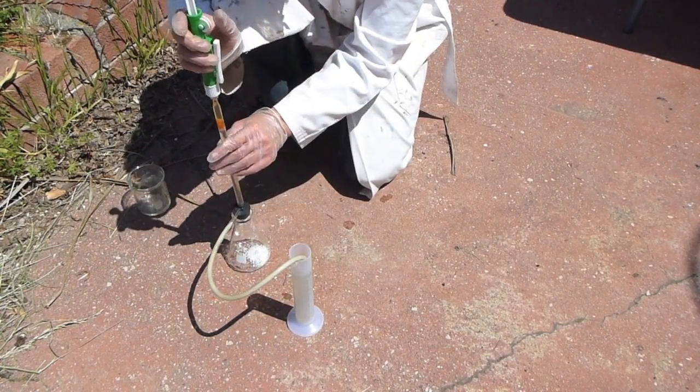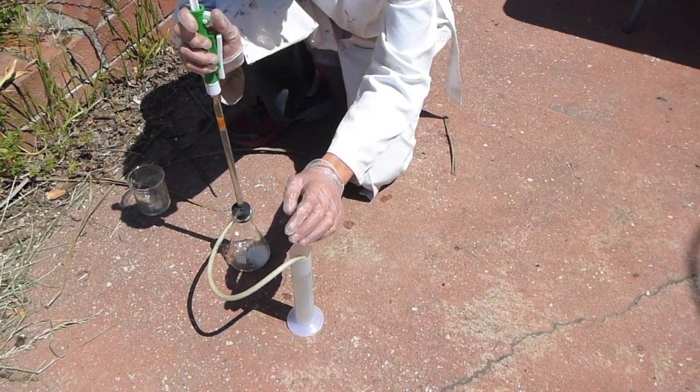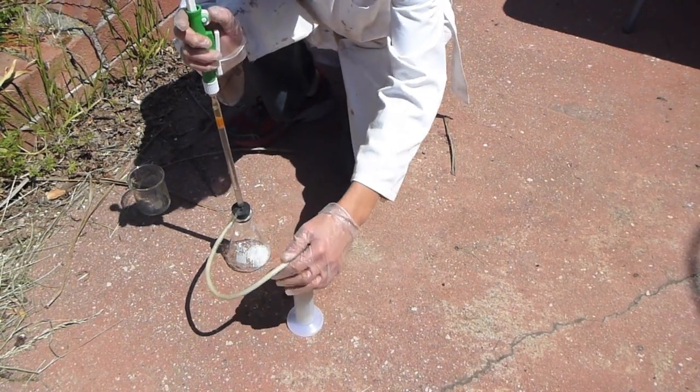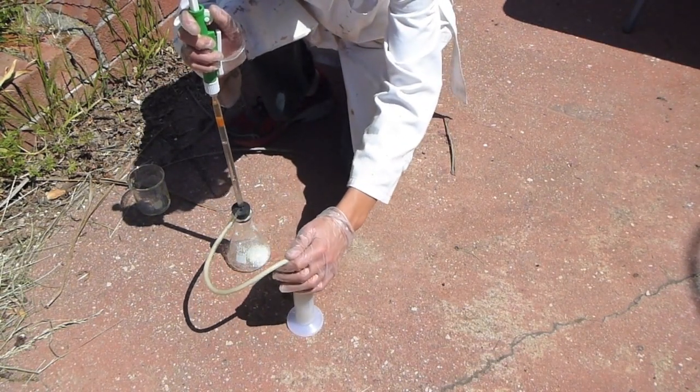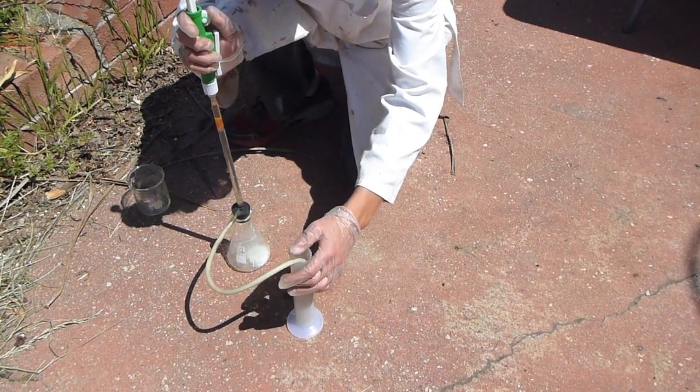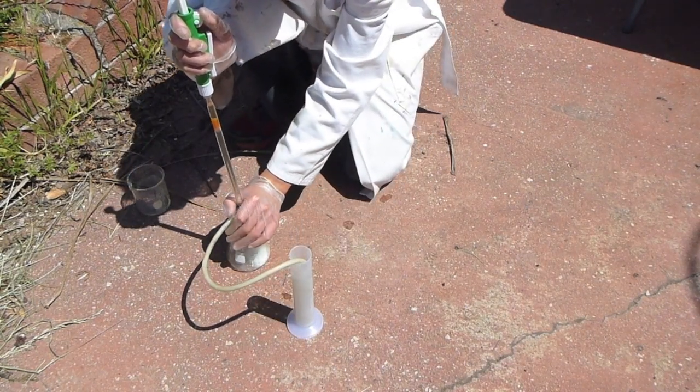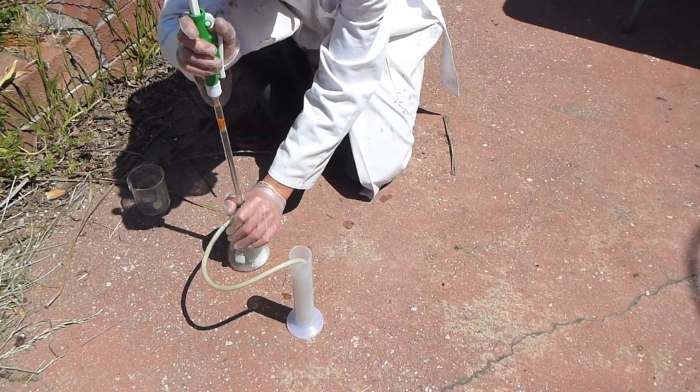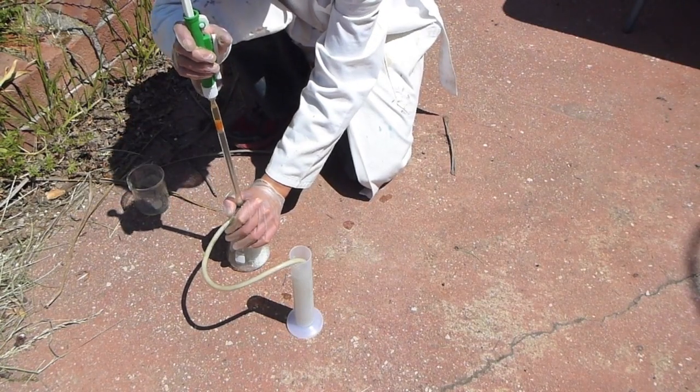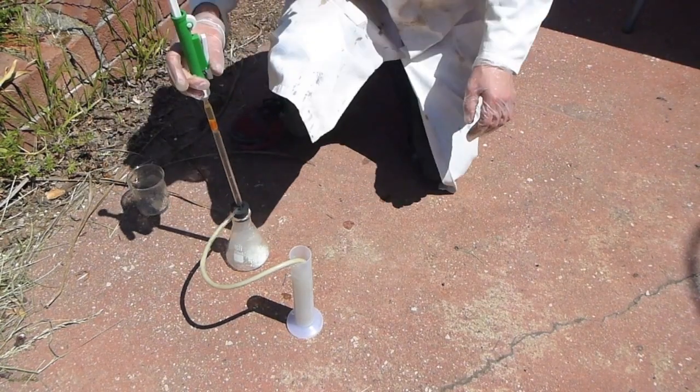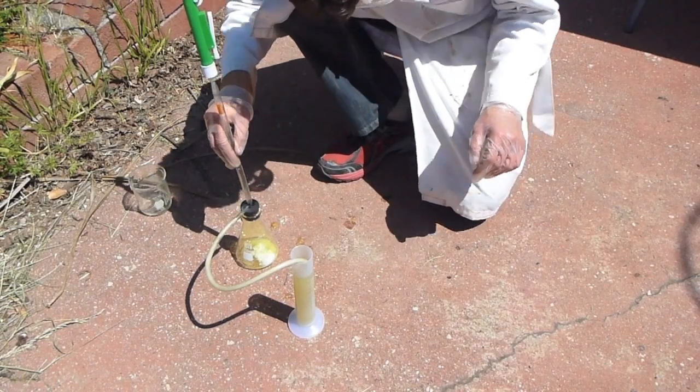And bubble the chlorine that's generated through the solution. Now the solution starts out a pretty light color, and it actually gets quite yellow, yellowish-orange after a while, and you can see now this solution is quite a bit more yellow.